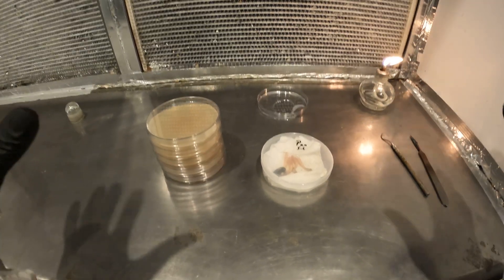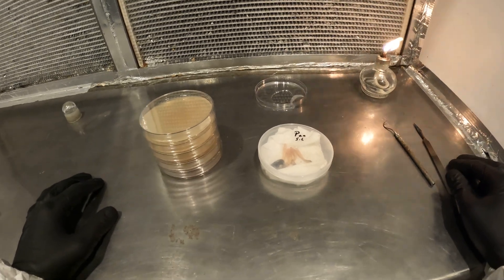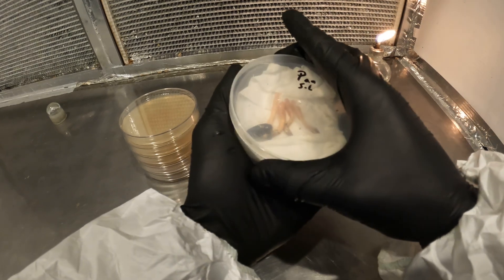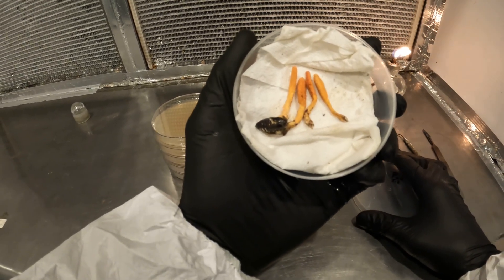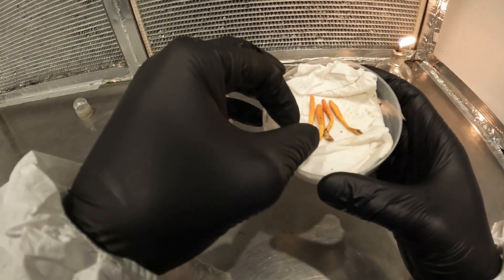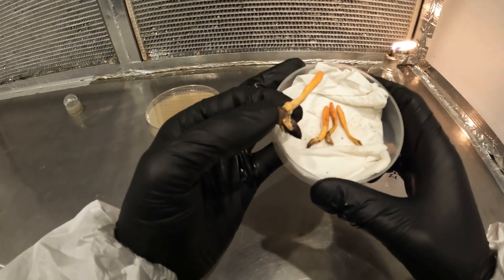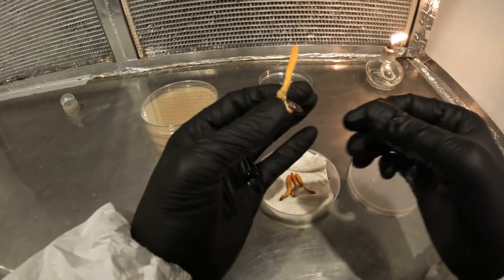Hey everybody, Brandon here — I See Fungi. I'm going to try to talk loud enough because there's a lot of fans with these flow hoods that'll drown my voice out. What I have here is all those cordyceps you guys have seen me gathering in previous videos. I found out an excellent way to store these things so they don't dry up as much. I found this one last Friday, and usually they're dried up by now.